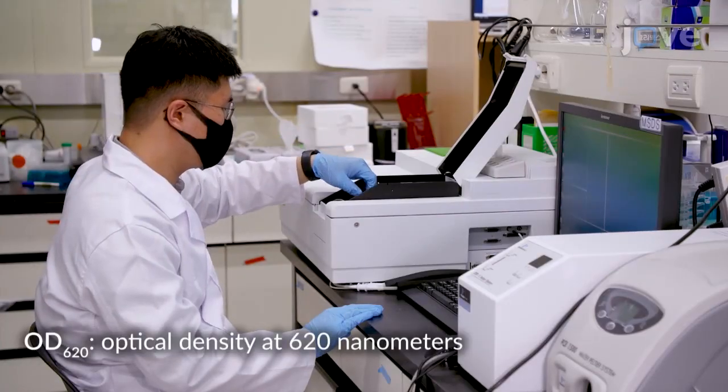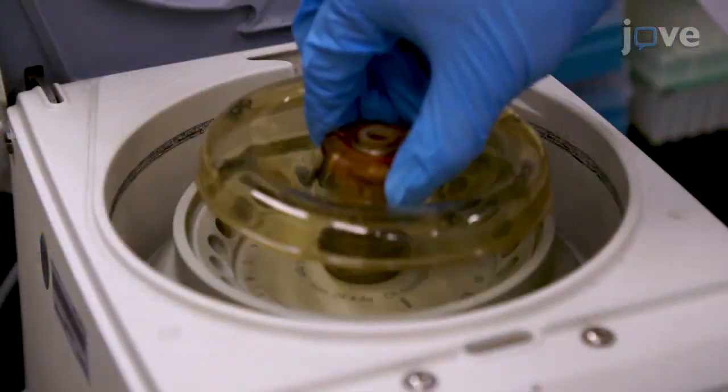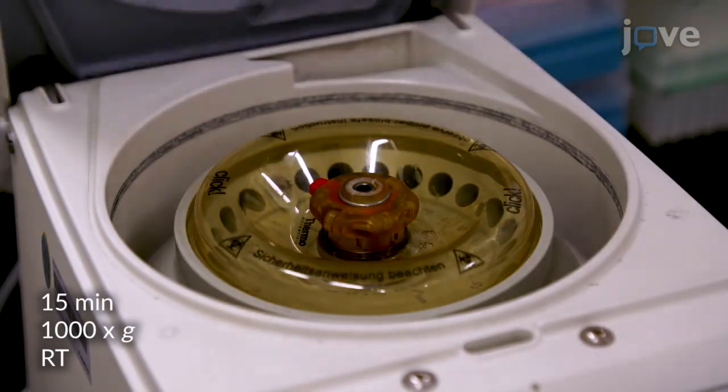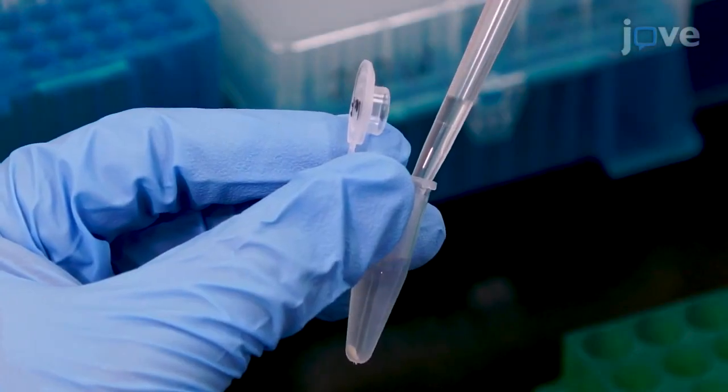After 2 days, measure the OD620 of the culture on a spectrophotometer. When the OD620 equals 2, sediment the bacteria by centrifugation and wash the bacteria pellet with PBS.